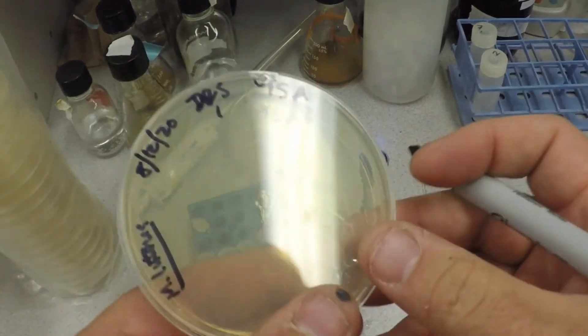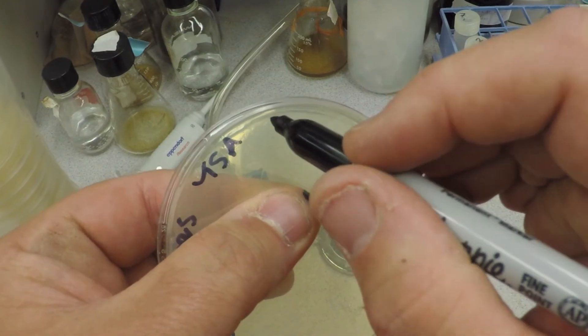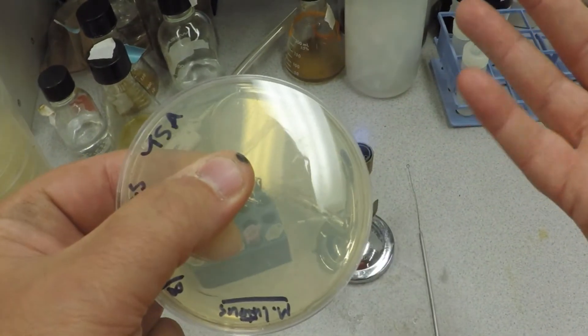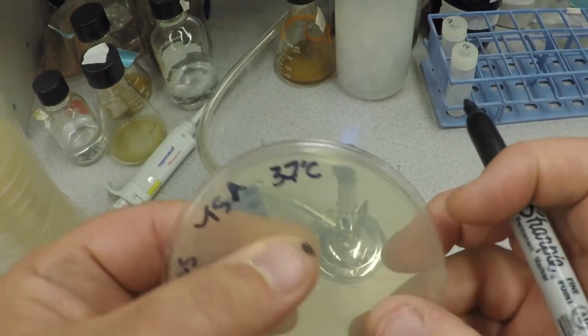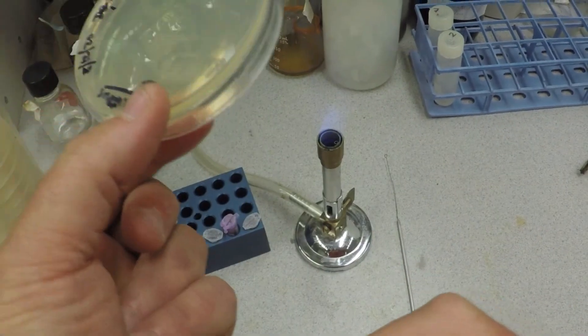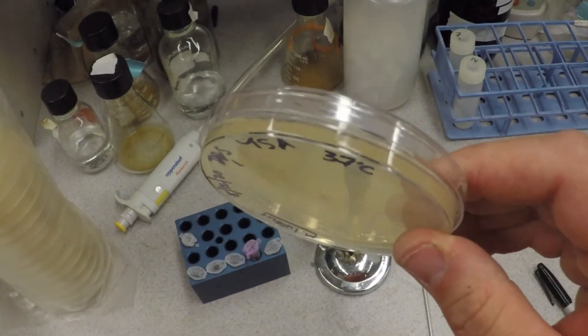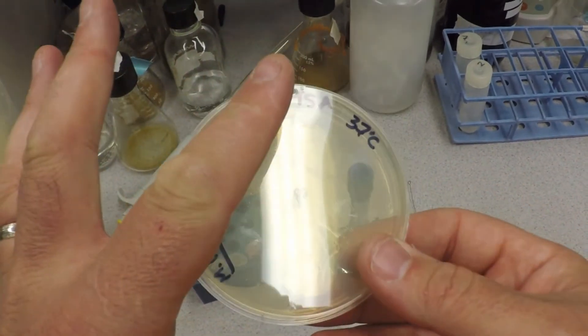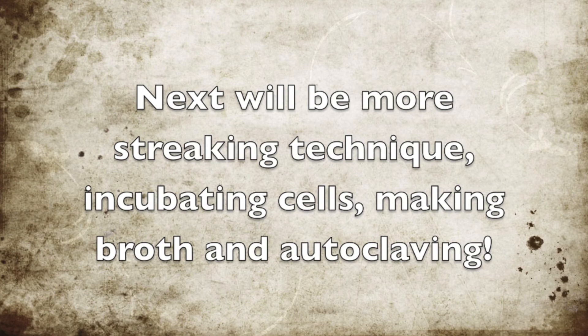We're going to incubate all of these at 37 degrees. Notice I'm also writing on the bottom, not writing on the lid. That's because what happens is these will fall, you'll lose the lids, and if all your information is on the lid, you'll never know what's going on. So always label on the bottom.